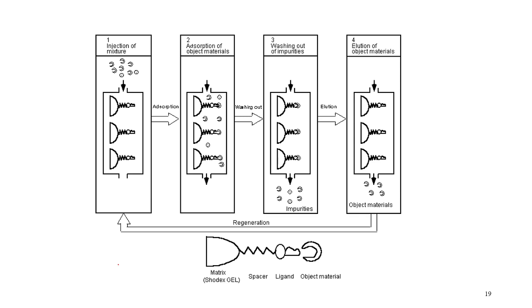where first you have to inject the mixture, after which your protein or the macromolecule undergoes adsorption and is attached to that bead. After that you have to wash out the impurities, because there would be some impurities present here, which you wash with a different kind of buffer. And then comes your elution process, where you would be using an elution buffer.